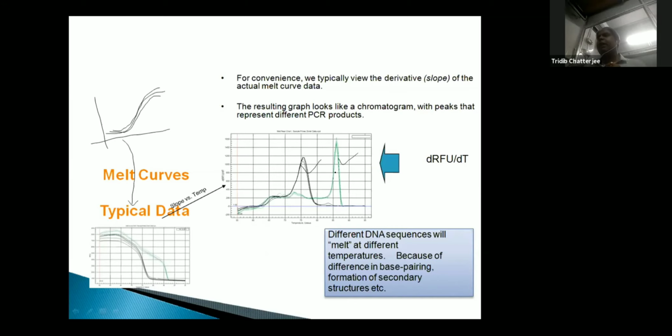These are applications where you do genotyping. For example, for HCV genotyping, there are many kits based on MELT curve analysis. Why is MELT curve required? Because between different strains, the sequence similarity is very high. So if we don't do a MELT curve, we cannot differentiate between the two.